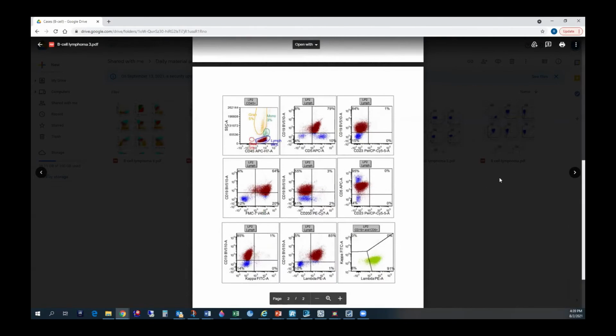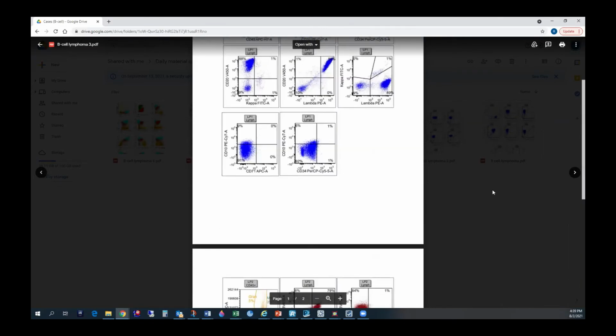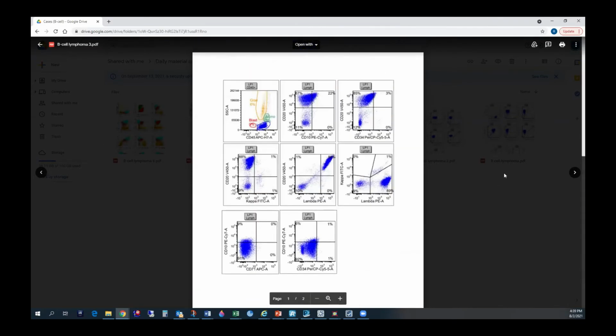Yeah, okay, sounds good. I have a question here. We used to usually call things bright, intermediate, dim. How do other practices do? Do you call them positive, negative? We call it positive and negative. Bright only if it is brighter than what we usually see. We don't usually use bright for everything positive.